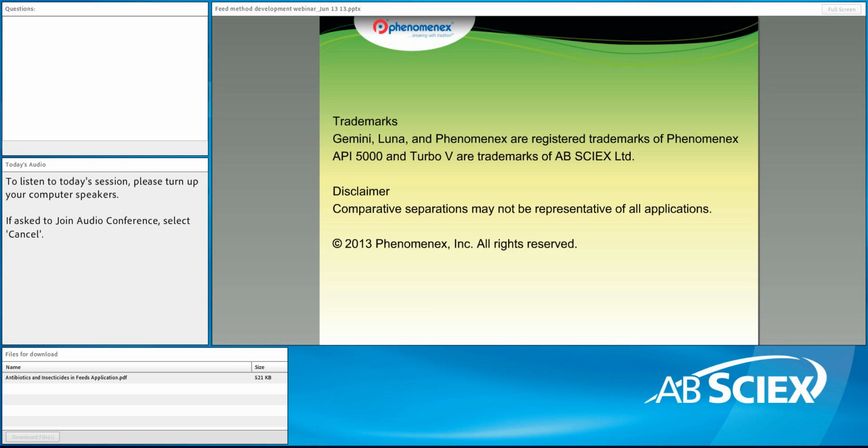Great. The next question is for Syed, and the question is, the run appeared to be 13 minutes long, and have you considered any chromatography to shorten that injection time?